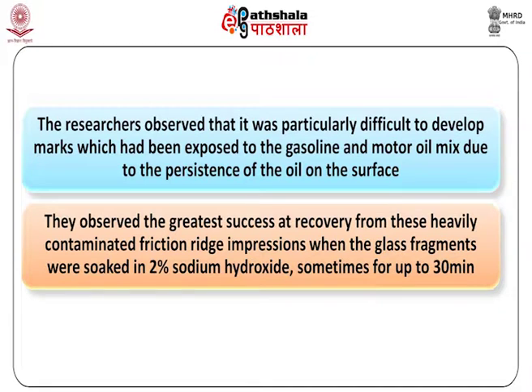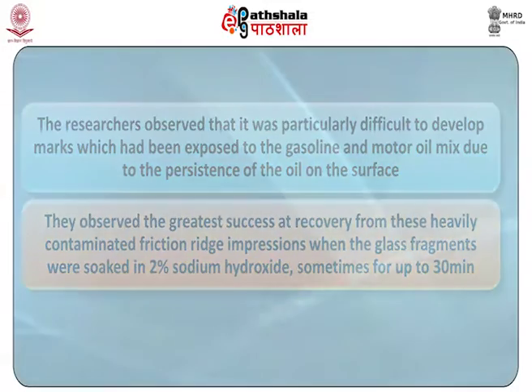They observed the greatest success at the recovery from these heavily contaminated friction ridge impressions when the glass fragments were soaked in 2% sodium hydroxide, that is sometimes for up to 30 minutes, that is half an hour.